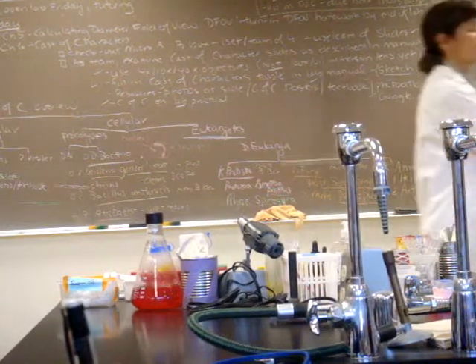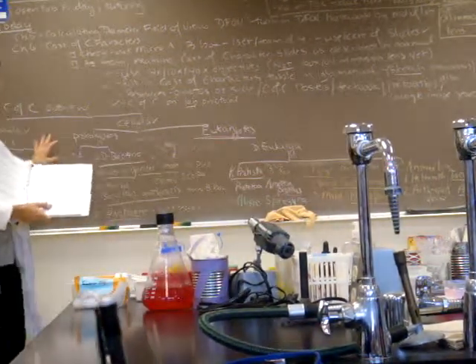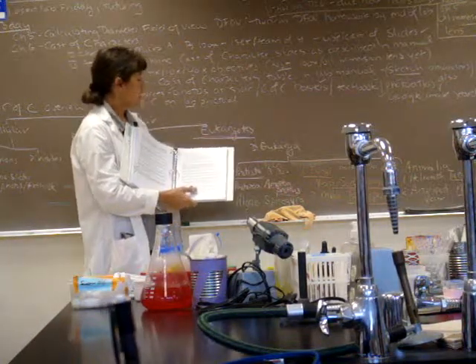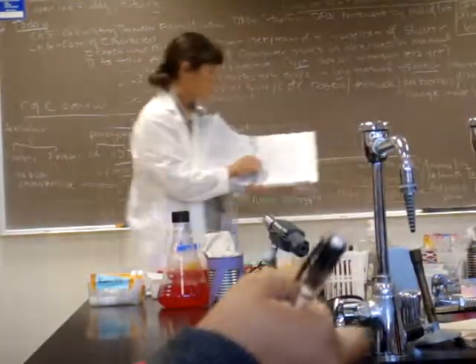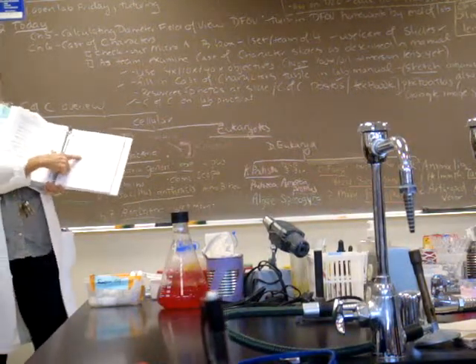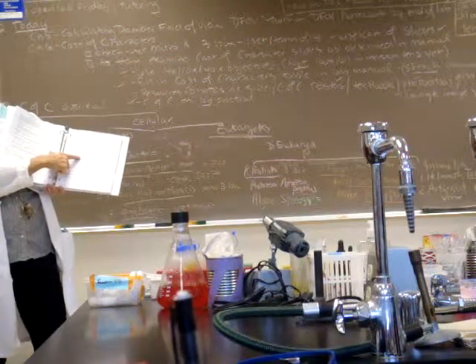So then we'll flip over to page 59, your eukaryotic microbes and other organisms. So we're going cellular eukaryotes, domain Eukarya. We have 2 examples of members of kingdom Protista. And the first one listed on page 59 is Amoeba proteus. Where are you going to find Amoeba proteus, you guys? Where are you going to find the slide? Micro B box slide 24, dynamite.